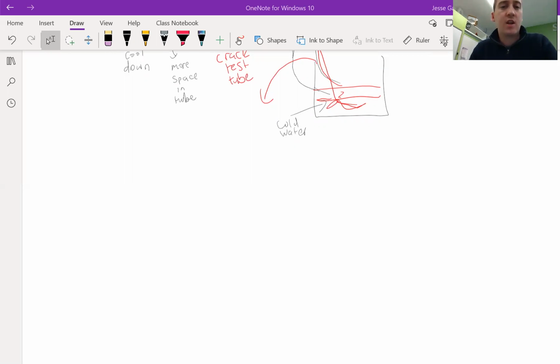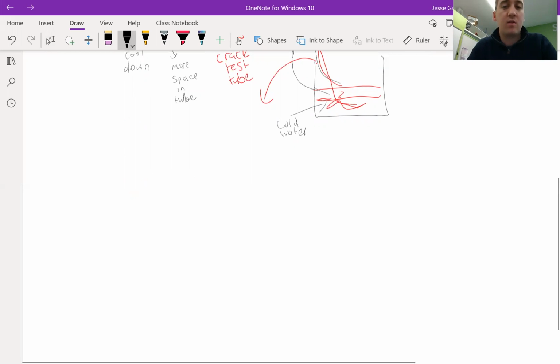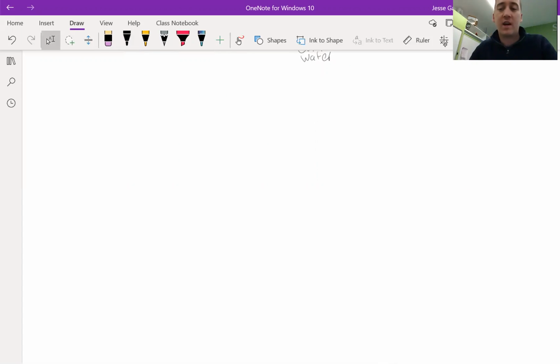So the first test that you can do on ethene is to test that it is a fuel, because when we learned about ethene, or the alkenes, we learned about them as fuels. So a fuel is a substance which can burn in oxygen to release energy. And it does this through a process called combustion. Now, we've just collected 4 test tubes of a gas, but we can't be sure what the gas is. So one of the tests we can do to see if it's a fuel is what's called a combustion test.